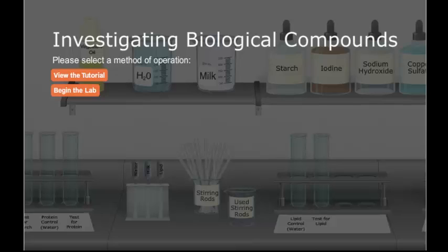Our test for starches will involve taking a solution, which we want to examine. You place it in a test tube and you add iodine. Iodine, when it is not exposed to starch, is a brownish color. When exposed to starch, iodine turns to a purple. So we'll be testing starch by using iodine.